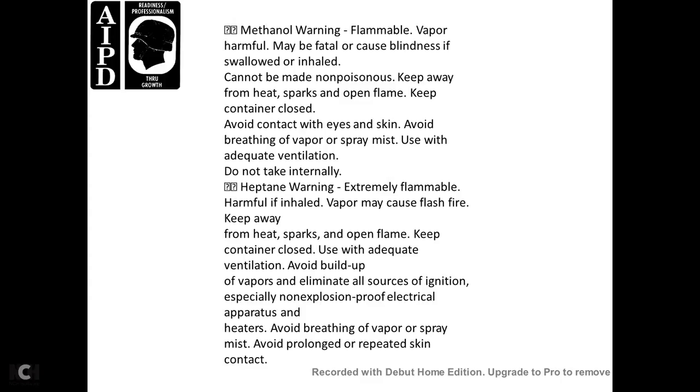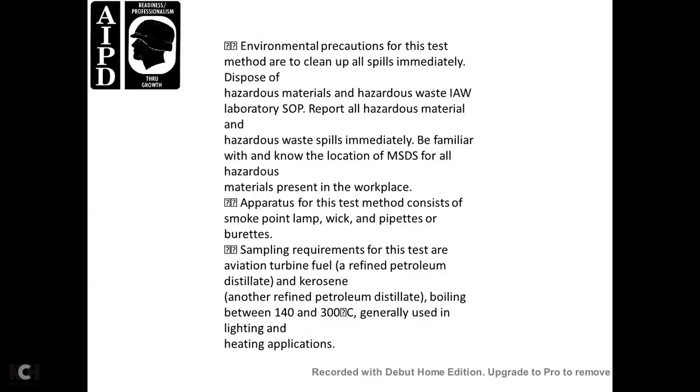Eliminate all sources of ignition, especially non-explosion proof electrical apparatus and heaters. Avoid breathing the vapor and spray. Avoid prolonged repeated skin contact. Environmental precautions: clean up spills immediately and dispose of hazardous material and hazardous waste in accordance with laboratory standard operating procedures. Report all hazardous material and hazardous waste spills immediately. Be familiar with all known locations of material safety data sheets and hazardous materials present in the workplace.